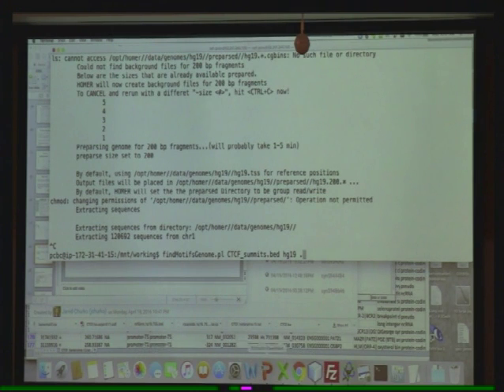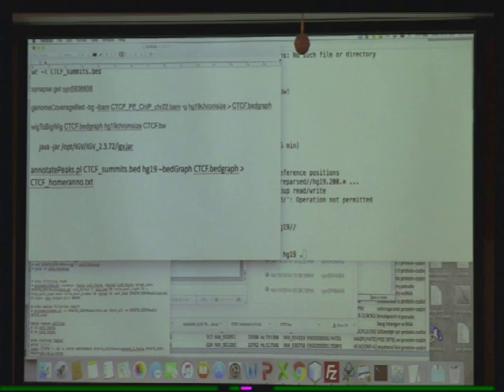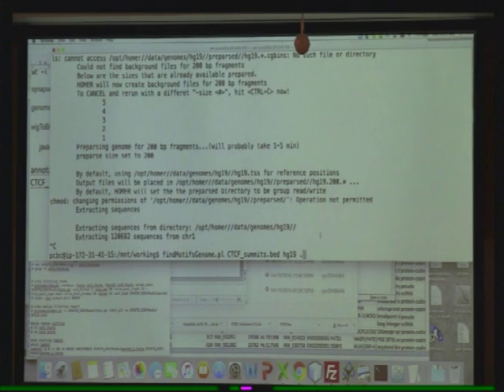Let's go look at the results directory. If you want, you can continue to run it yourself. It took that bed file from MACS. Everything starts out with MACS, and then you get the coordinates of all your peaks, and you can go from there.